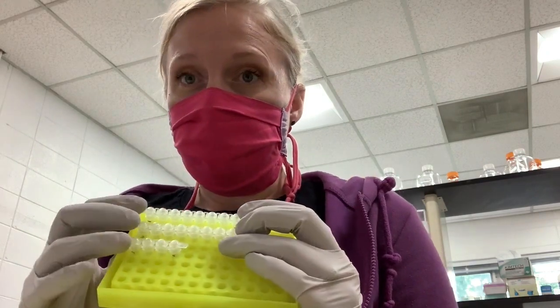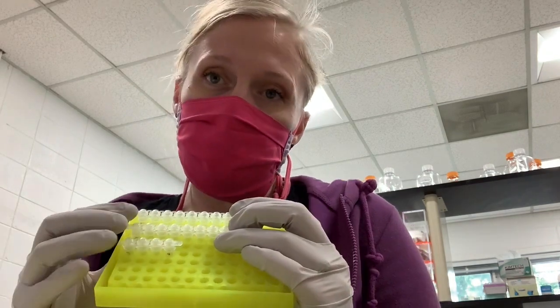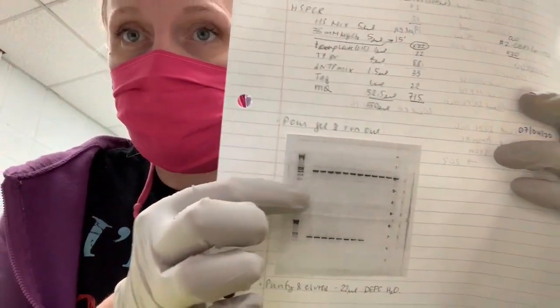I've also run out these samples on a gel prior to this protocol to make sure that I have a product for each reaction. So I've done my DNA gel to make sure I have something. You don't want to just assume that you have DNA and do this purification. It will waste reagents. So you want to run out a gel first.